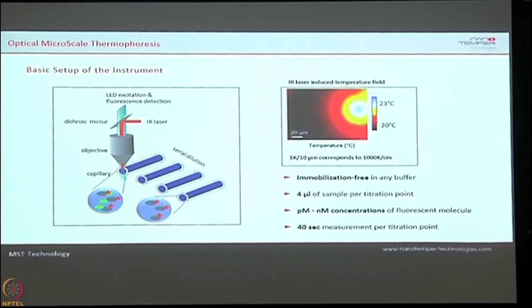That is the biggest advantage of this technique. Many people ask how much temperature we are creating. It's a very steep gradient, as you can see in the slide, 20 to 23 degrees. So that temperature doesn't affect any of your molecules.